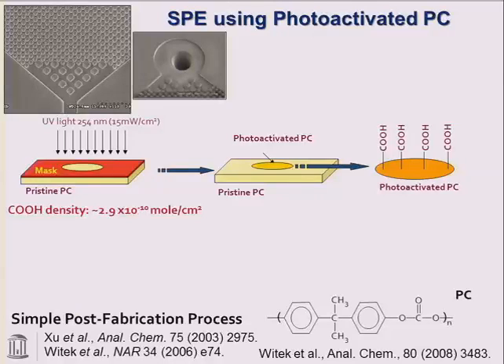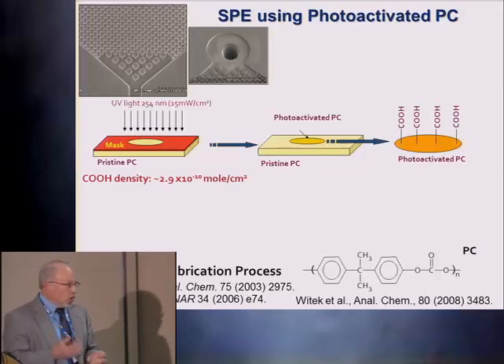All right, now, this is a very interesting phenomenon here. This is a material-dependent process. Whenever you lyse cells, chemically or electrically or thermally, it really doesn't make a difference, you generate a lot of junk. And typically, before you do the molecular analysis, you employ a solid phase extraction, as Claudia alluded to.